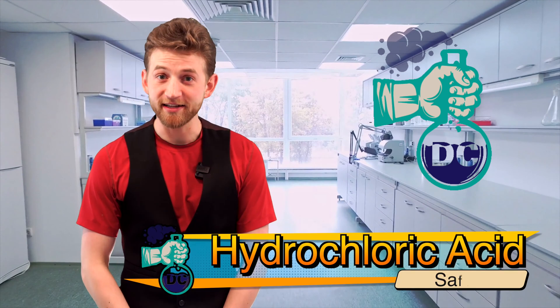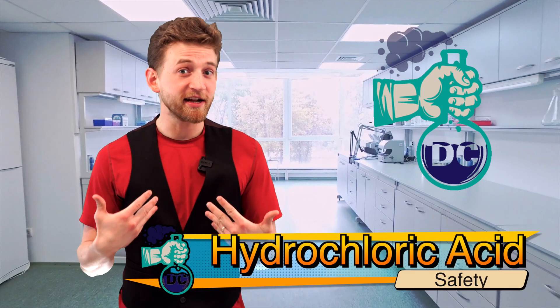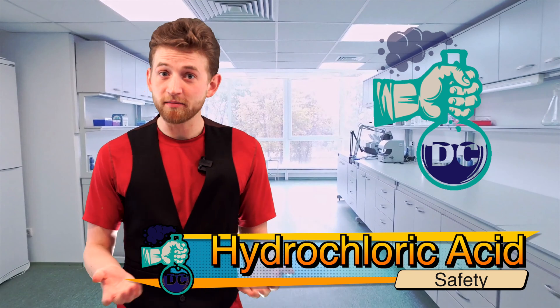Hey, welcome to Destructive Creativity. I'm Jonathan Allers. Today we are going over the safety tips and tricks with hydrochloric acid. I'm going to be testing it out on myself — getting some on my skin on purpose so that you know what to expect should the worst happen.